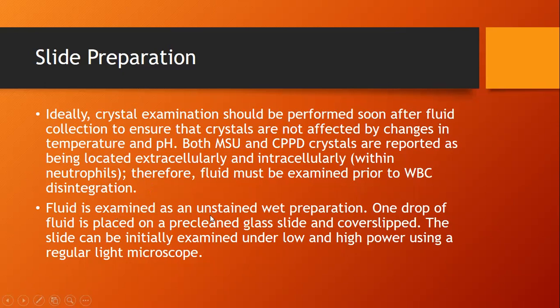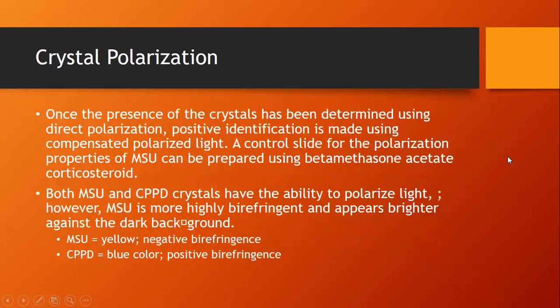Usually, the fluid is examined in an unstained wet preparation, such that a drop of the fluid is placed on a glass slide and cover slipped. And the slide can be initially examined under low and high power using a light microscope.